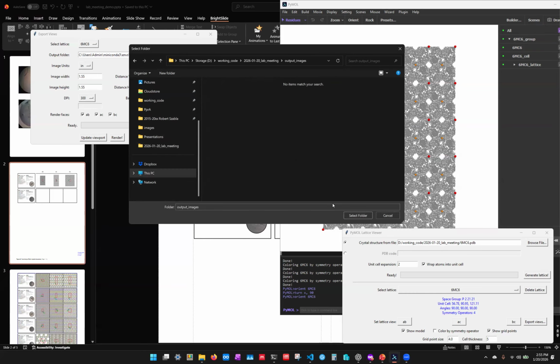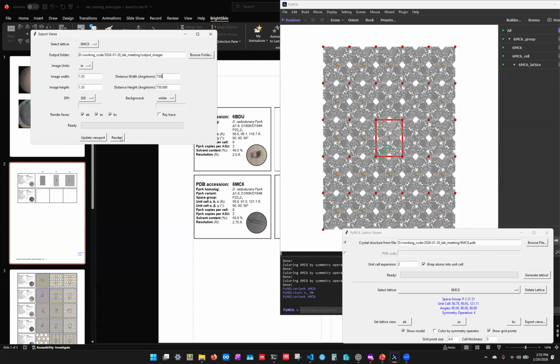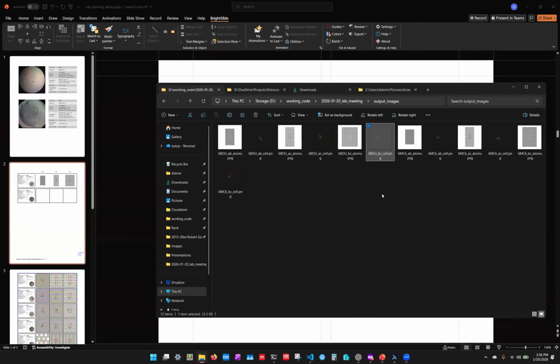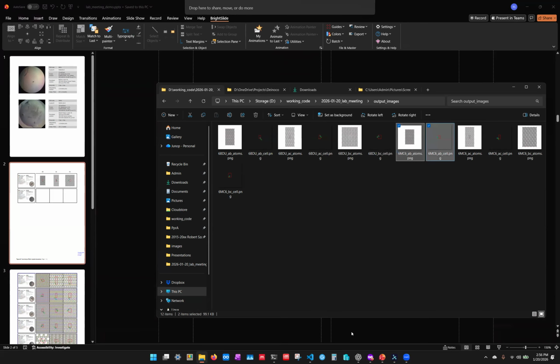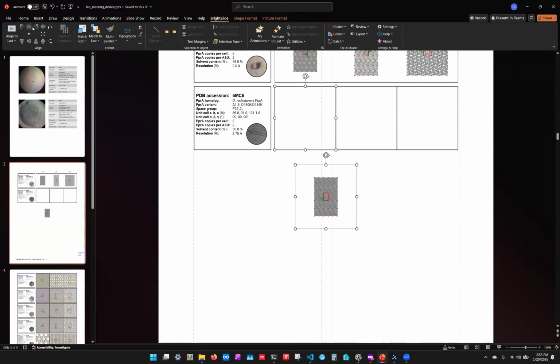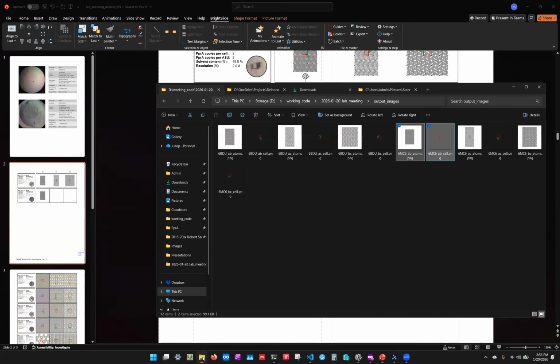Okay, got it. Nowadays these programs are so good, amazing. They're better than anything I could ever judge by. Maybe Han could do a better job, or Alba, or someone who's a really hardcore crystallographer. But even Han was shocked.